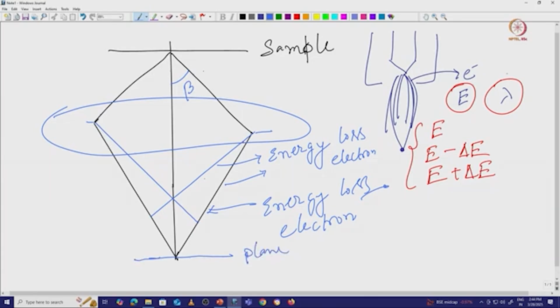So if we consider that some electrons are converged at one particular point, then at the actual image plane those rays will come and form an image, and that will give us some kind of blurred image. So the images will not be that perfect, and it is going to affect the contrast as well as the brightness of those images. Now this is all about our chromatic aberration, and if someone is asking, definitely chromatic aberration is also there in the electron microscope in a different form.